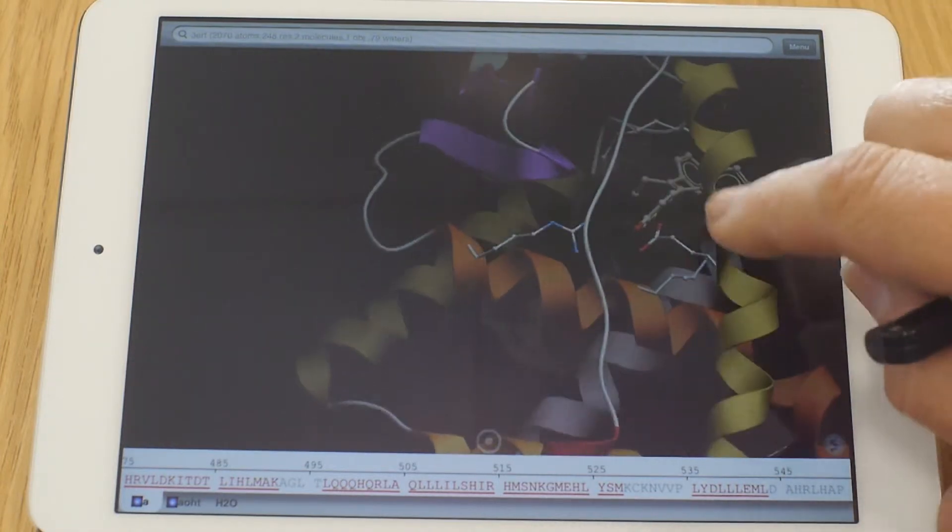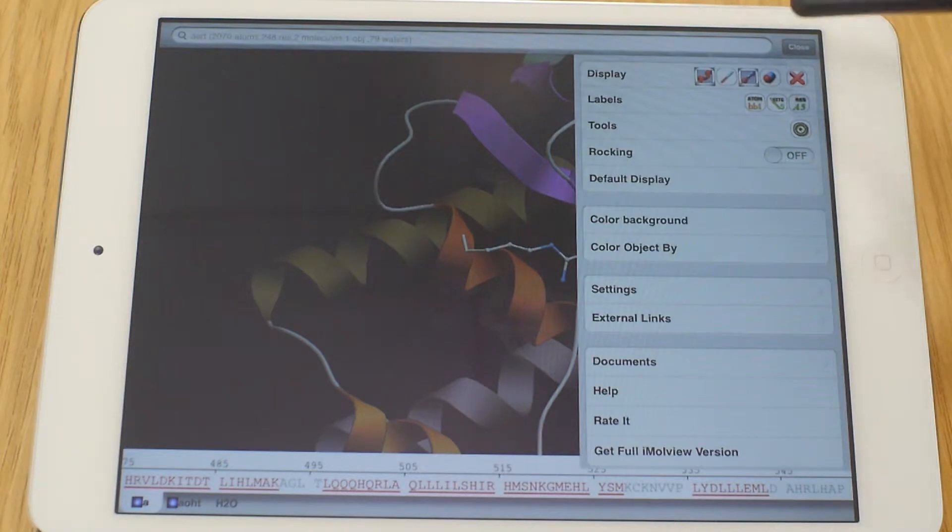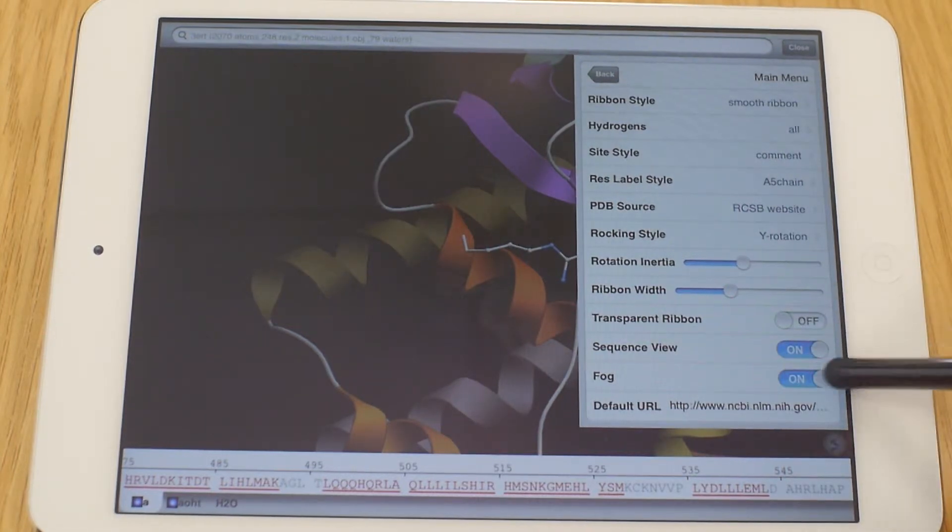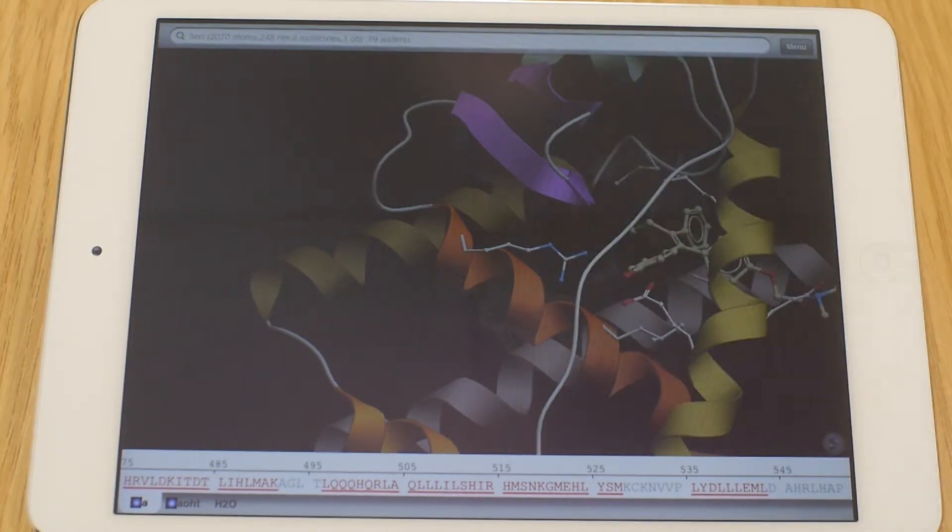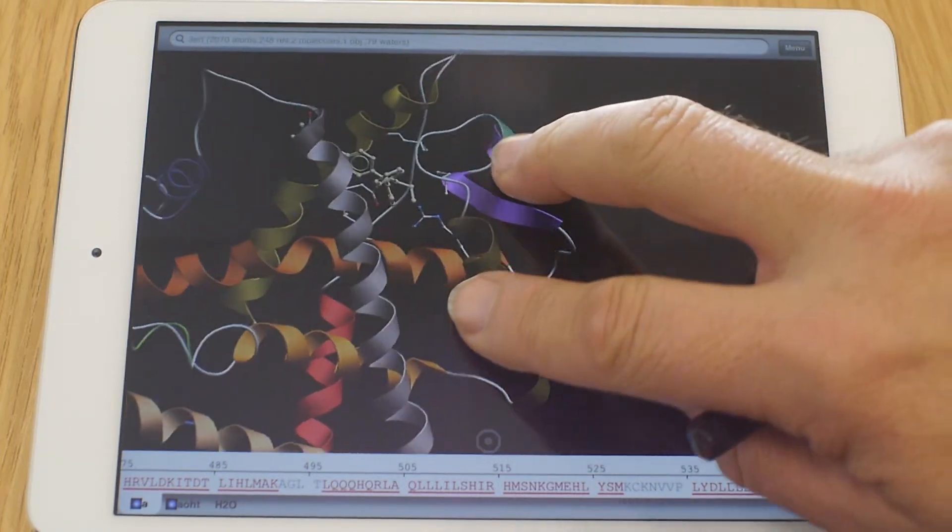Okay, so there's something about this view I don't like too much. It's not very bright. Now maybe you're okay with this. Let's go in the menu. And this has switched something on that's called fog. I think it's in settings. And here you see the fog. This gives you a three dimensional idea because items that are in the back of the plane be a darker. I don't like it too much. Let's switch it off. You can see, particularly for this movie, it's a lot brighter now because everything has the same brightness.